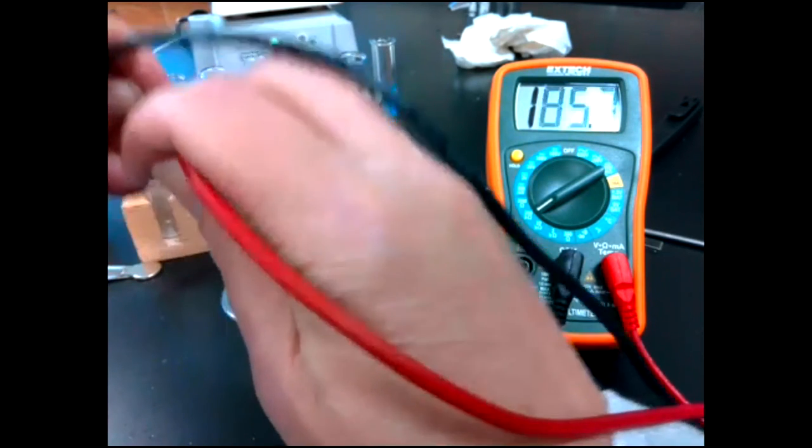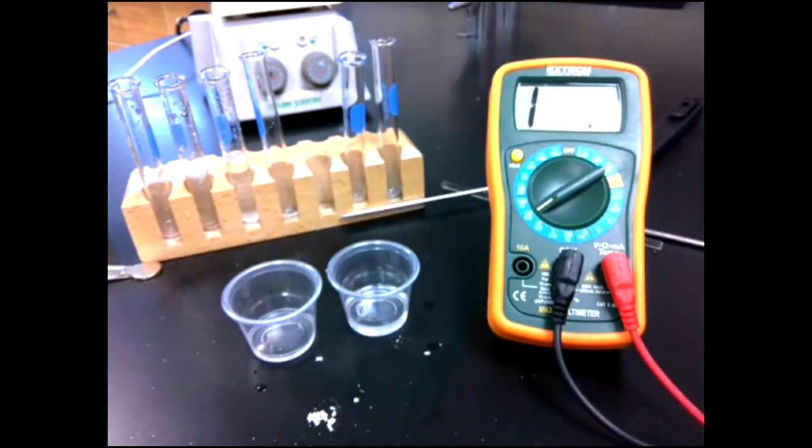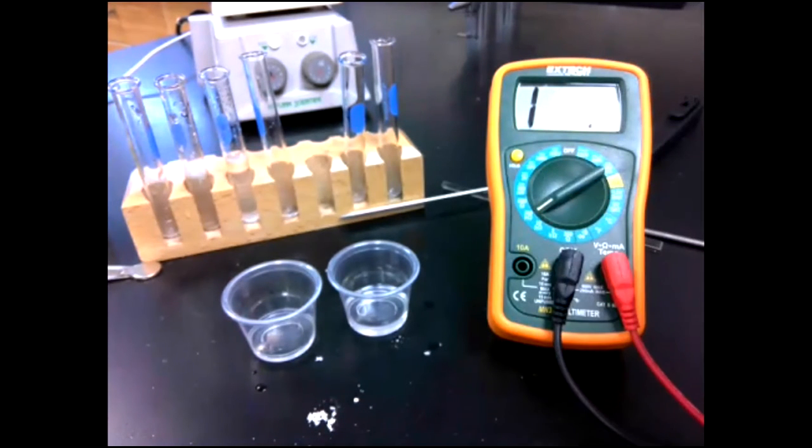If we had a better probe, conductivity meters are actually really, really finicky, then we could measure how much it's conducting, but this isn't doing that. This is just telling us, yes, it's conducting electricity.